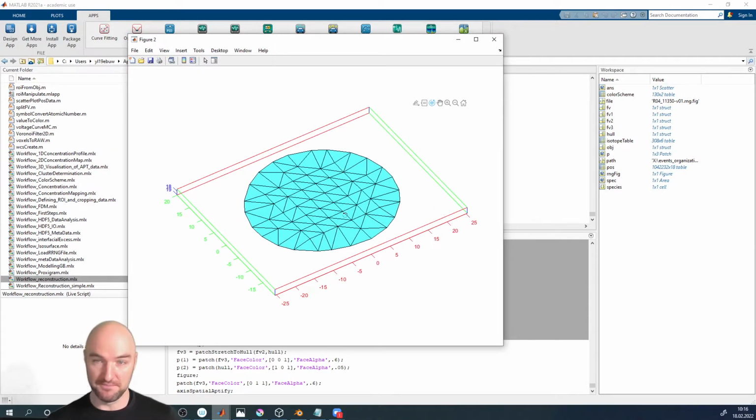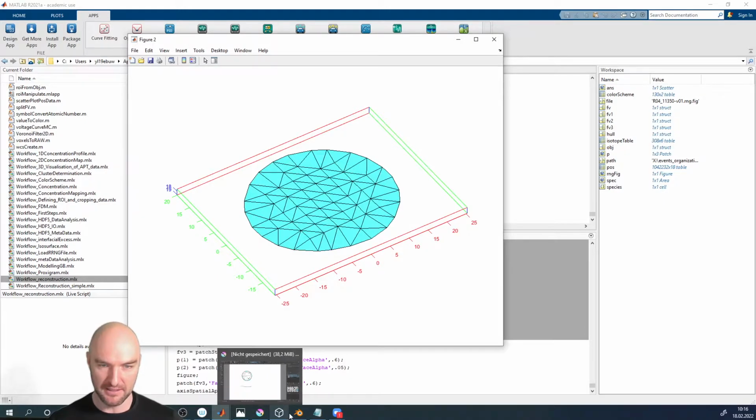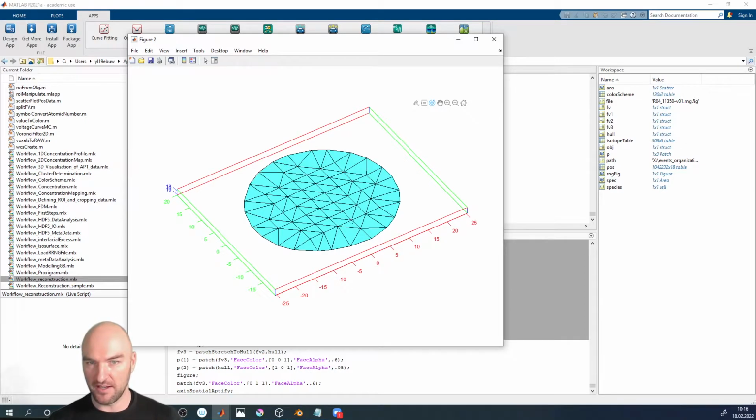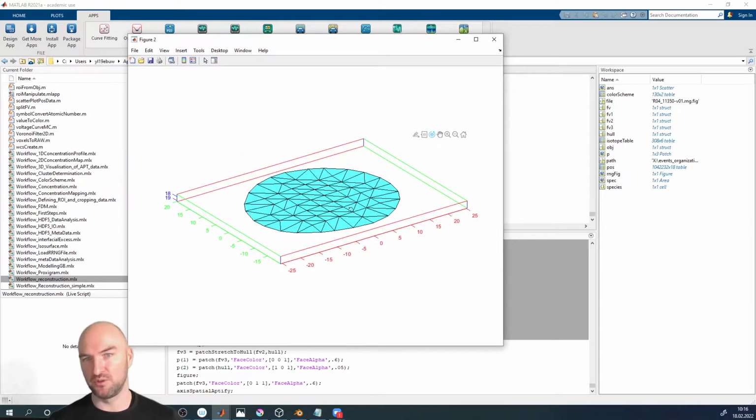How do we do that? Well, there's another algorithm. You could do that by hand. You could go and move them by hand and distribute them however you want them to. And sometimes, that's actually not a bad idea. There's a lot of tools actually in Blender that allow you to do stuff like that really efficiently. So you can move vertices around, even if it's hundreds or thousands of vertices. In the last 15 minutes, we're not going to have the time to look into that, but we can also do that using algorithms. And the algorithm that we are going to use for that is called a centroidal Voronoi tessellation.